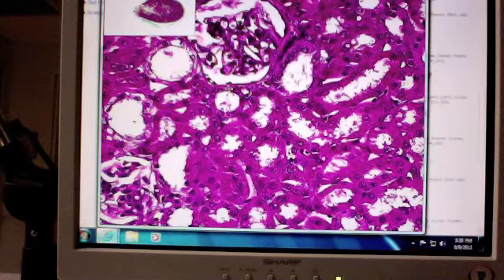Dr. Opperman, is it the top arrow or the middle of the arrow? The top, unless I say otherwise, it's going to be at the top, okay? I could also, in this case, say, my pointer is spanning what kind of cell? And that would be simple cuboidal cell. Correct.